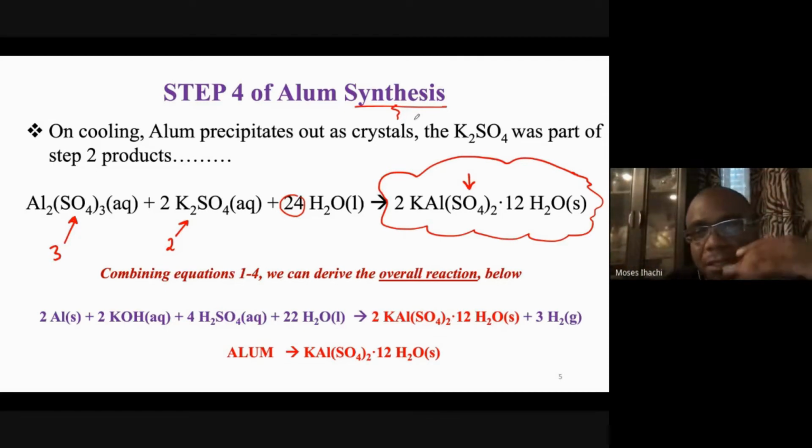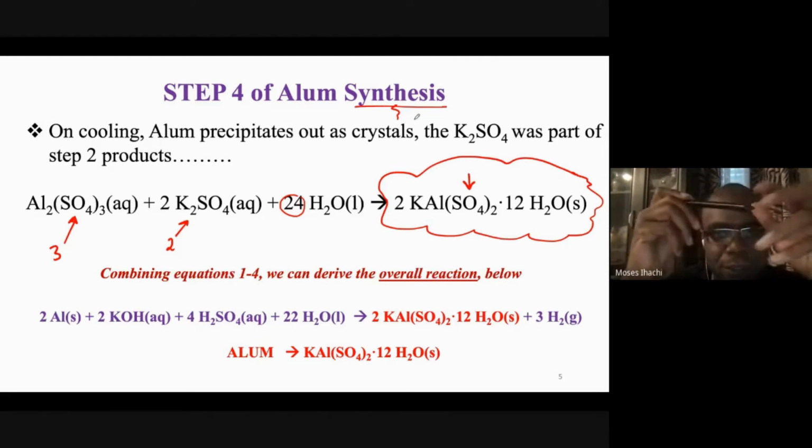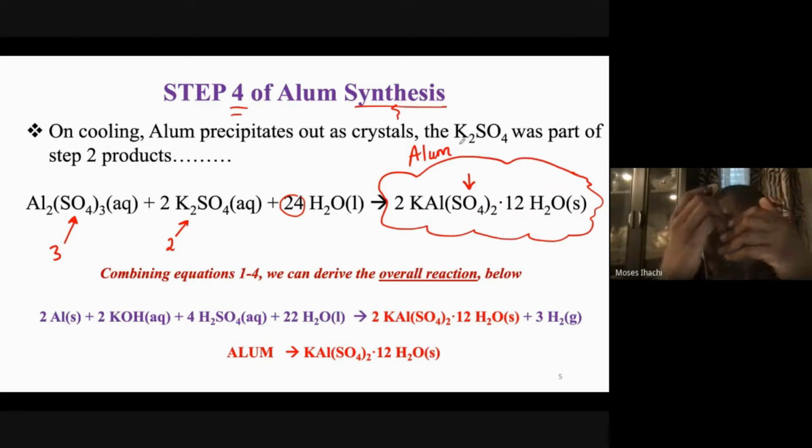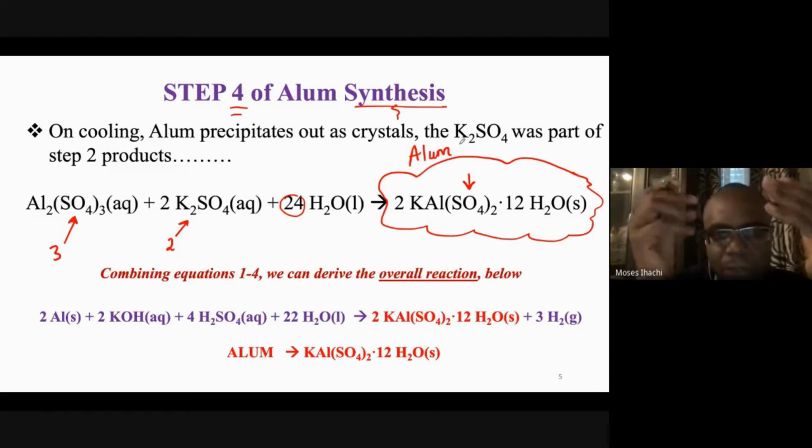It just depends on the process and on what you're making. So you might keep on doing the reaction to the end. Because there are so many steps, for example, how we've gone up to 4 steps to make the alum, there are so many chances of error. Those errors could be systematic or random errors.